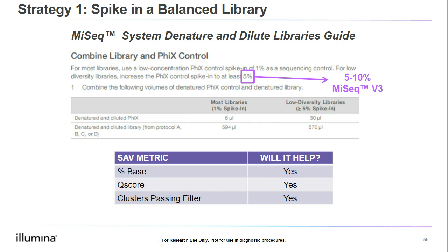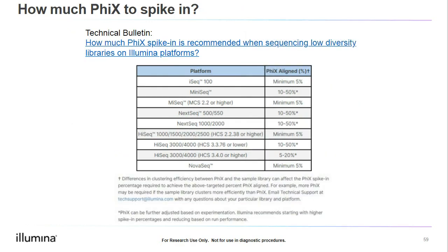Please note, if we are sequencing tagmented amplicons, we don't need as much PhiX due to the random fragmentation of the transposons. The PhiX spike-in percentage will depend on the instrument you are using. We have a helpful bulletin which outlines the recommendation for each sequencer here.